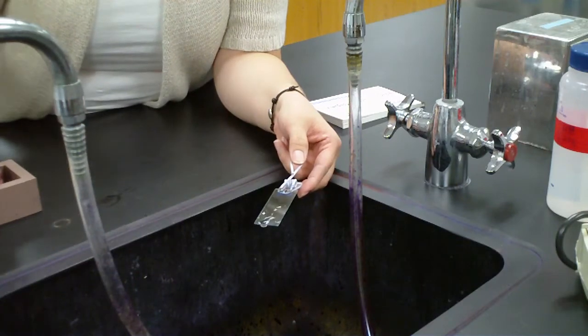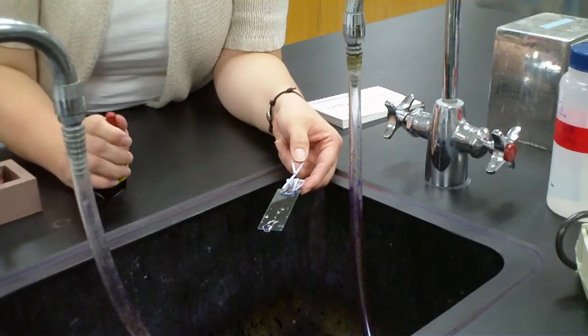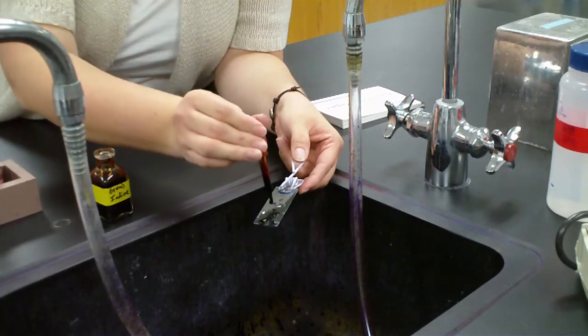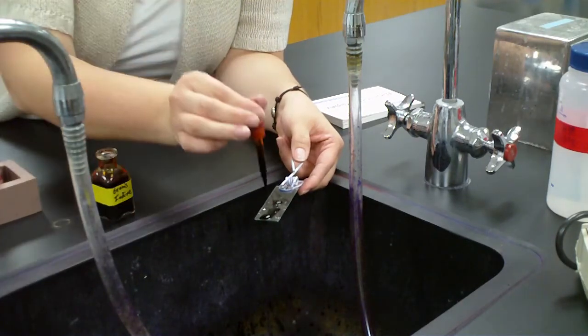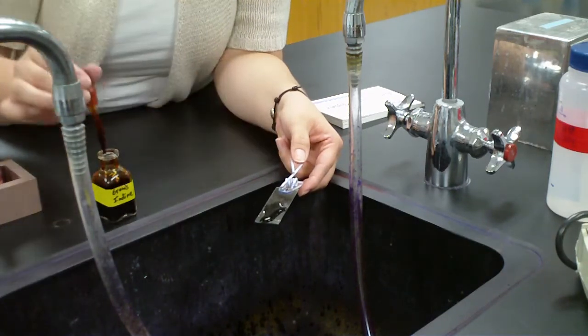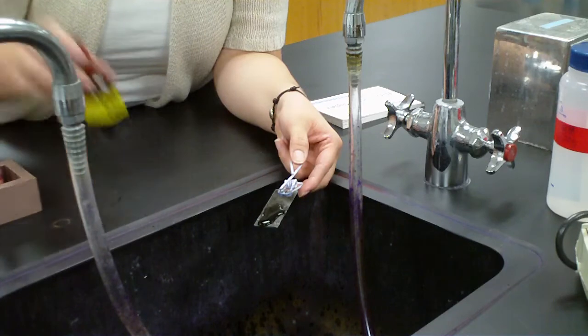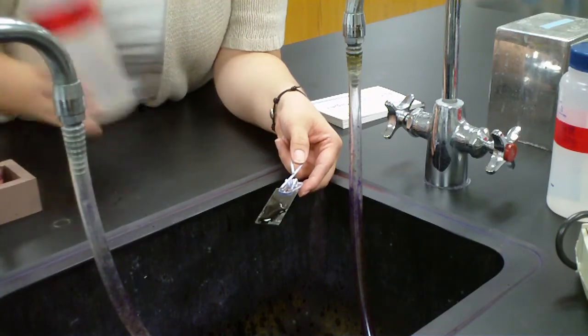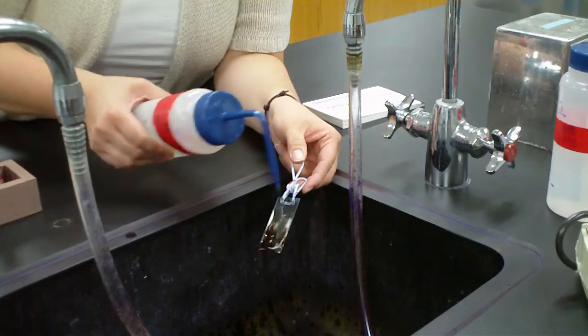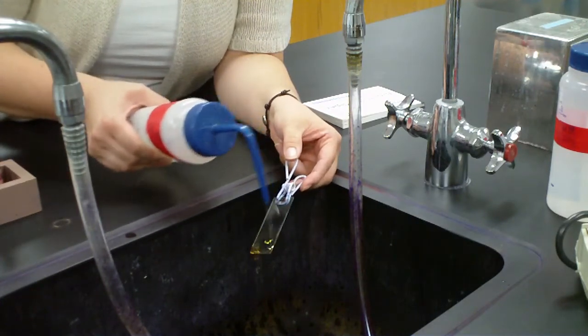Then I'm going to flood my slide with gram's iodine. So I go ahead and flood the slide with gram's iodine. Make sure I cover the entire smear. Okay. I would then let that sit for a minute and chat with the people next to me while I'm watching the clock. Go ahead and rinse off the excess gram's iodine.